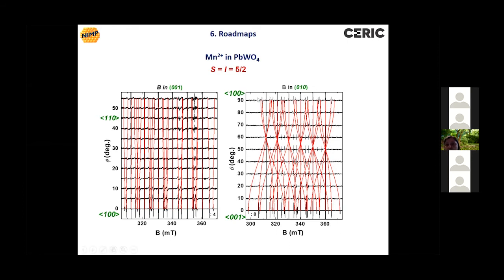if the spectrum itself wouldn't be here, you'd know that the hyperfine lines, from the same hyperfine structure, do not interact. So you look at the lines which go parallel with each other. So you look at 6 lines which go parallel with each other, and this is one group of lines. And the intersection of the lines comes from the zero field splitting. So yeah, this is just a first idea how to look at a complicated roadmap.